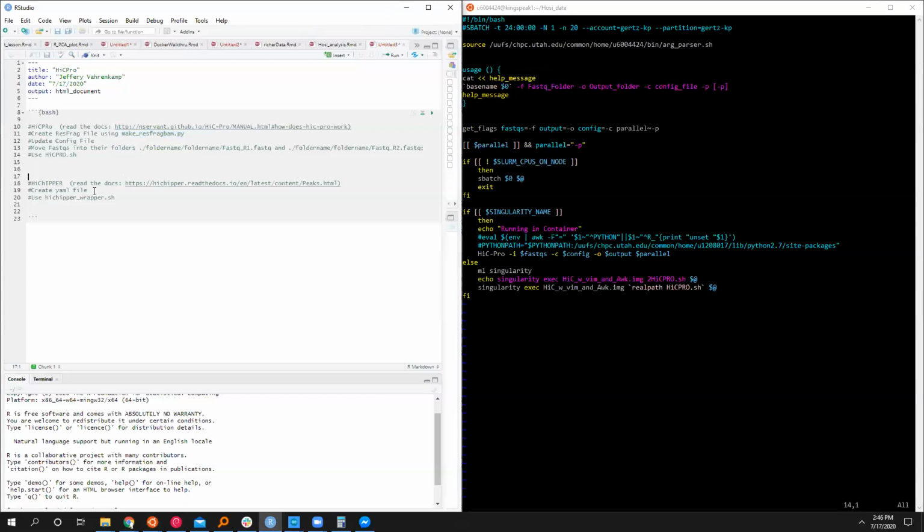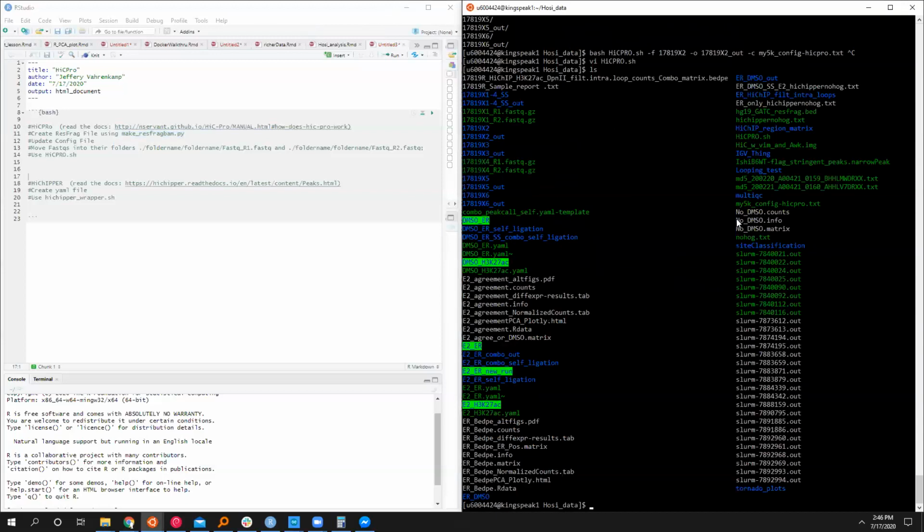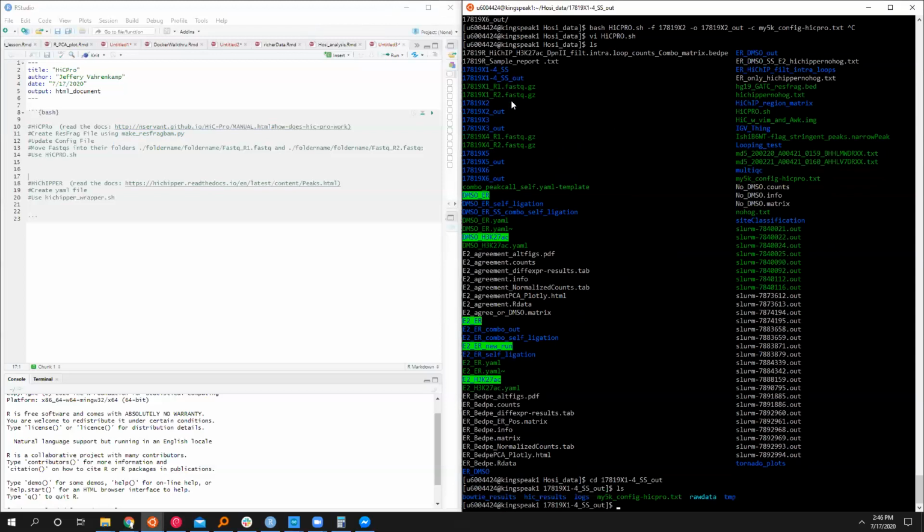Once that's done, the next program you're going to run is HiChipper. And what HiChipper does, let's see if I can remember. Let's just look at what the output from HiC-Pro is.